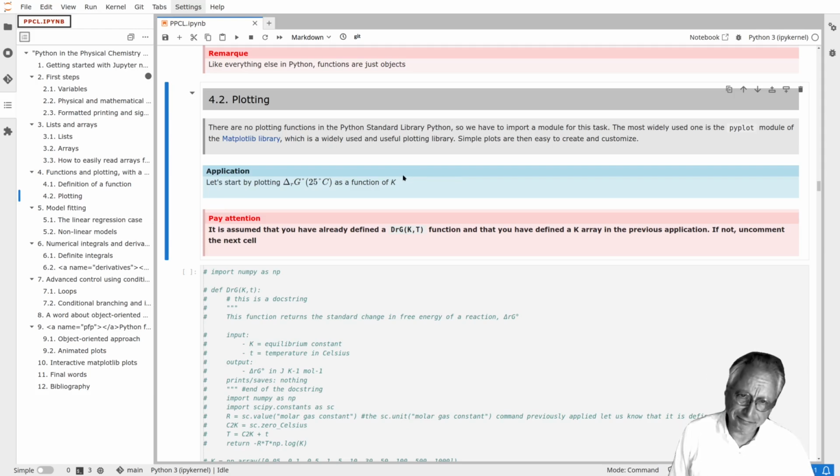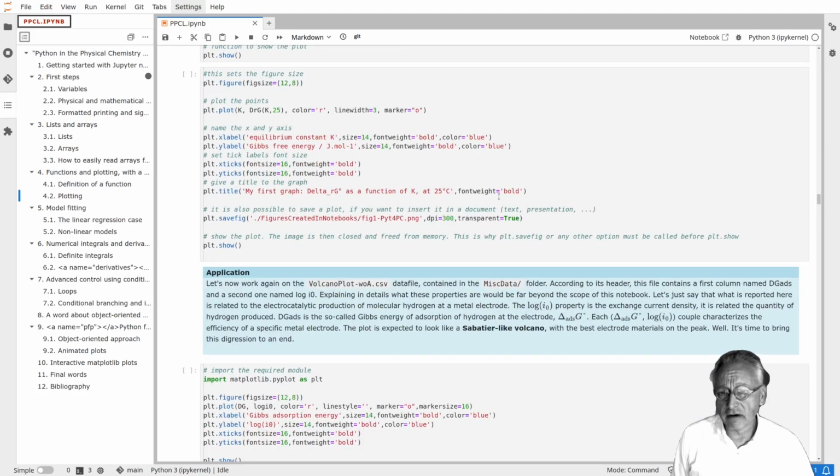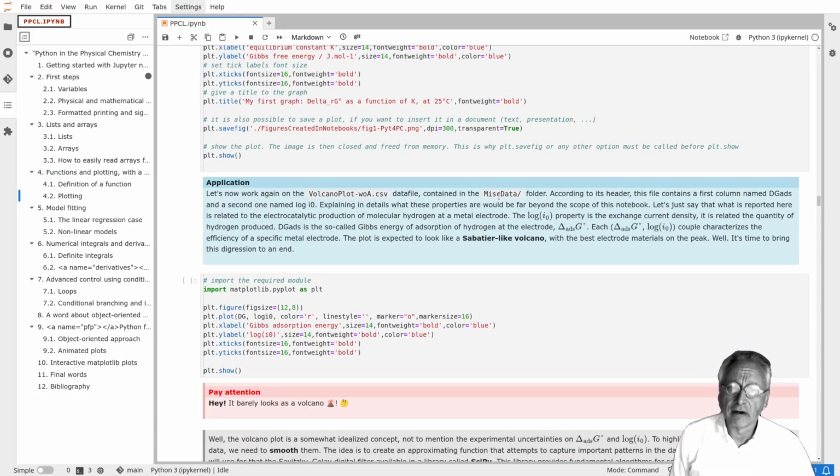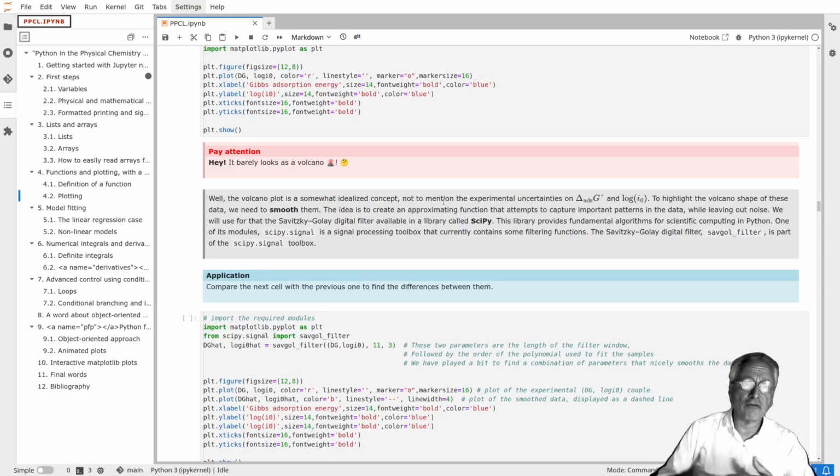The basic Python library is matplotlib, which contains the so-called pyplot module. You can get familiar with plots here and have a reminder of how to do them. We do not see the output of these cells because you will run this notebook, answer the exercises, run the cells, and analyze the outcome of each operation.